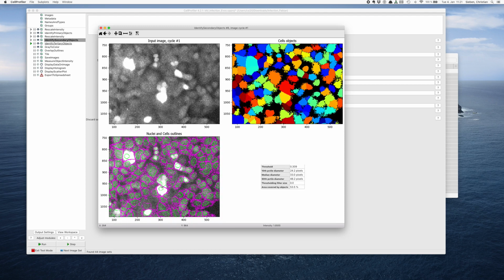You can look around a little bit here. It cuts off a little bit of the cytoplasm and so on. So with a dedicated cytoplasmic marker, this should be more straightforward. But in this case, we would anyway only use the nuclear object, but to have an example pipeline for cytoplasm and nucleus, I keep all of these things in.